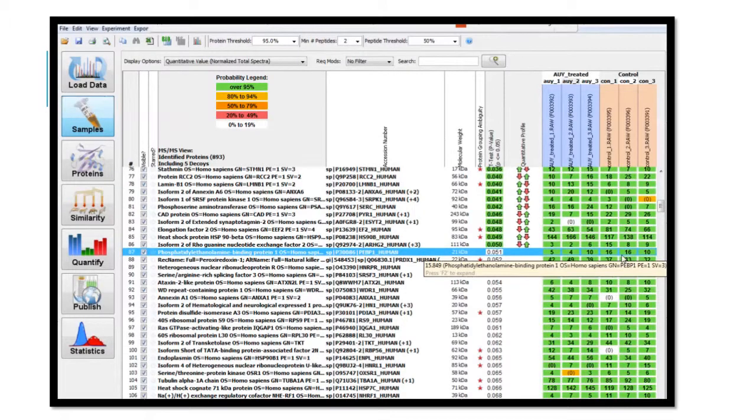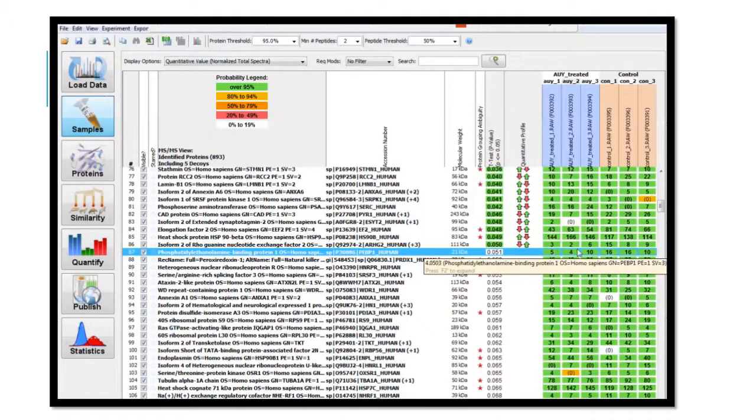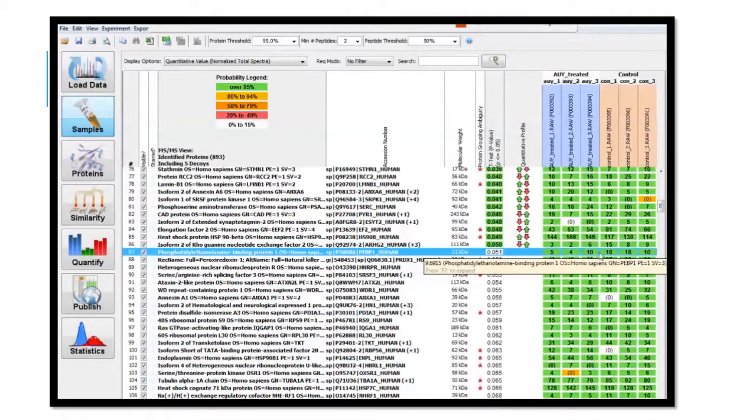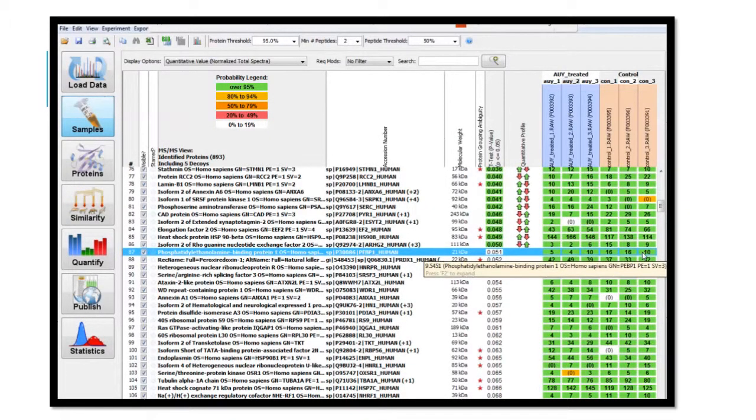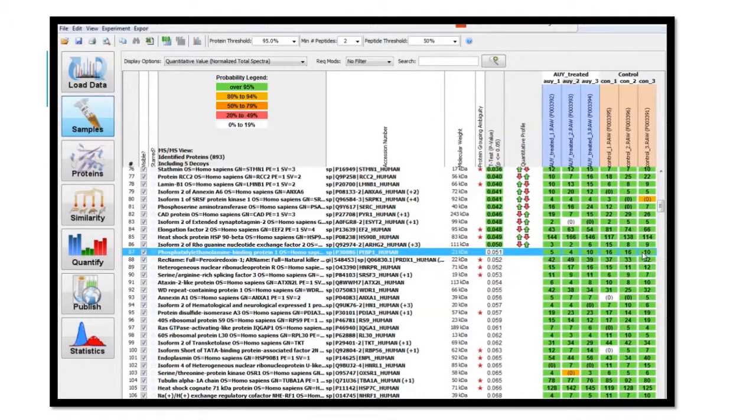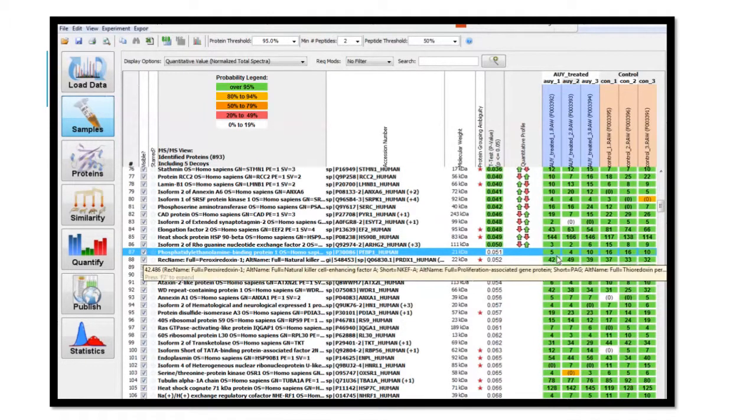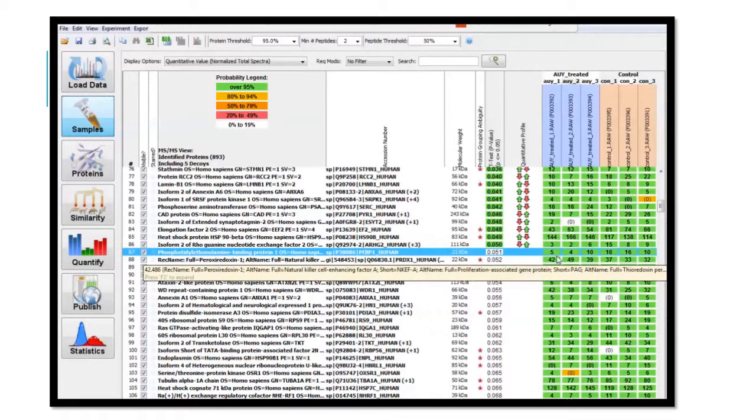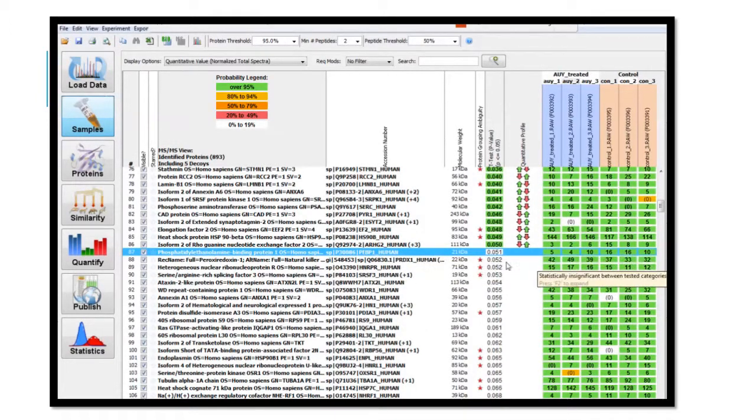If the control cells are normal, then I can interpret that 5, 4, and 10 are less than 16, 16, and 10. This tells me that the protein phosphatidylethanolamine binding protein 1 expression levels are likely lowered in the AUY922 treated cells when compared to the control cells.